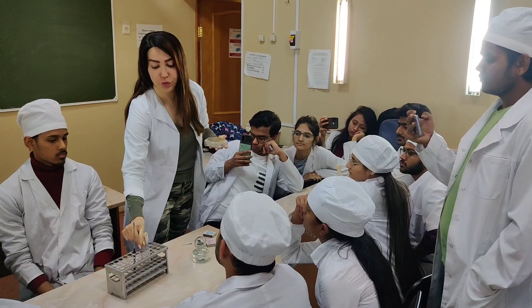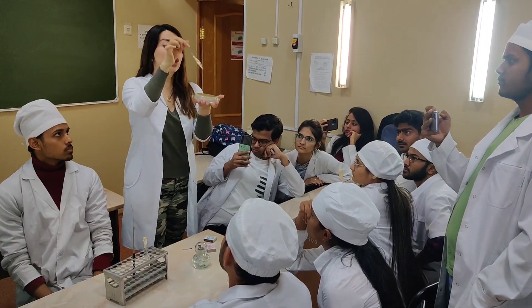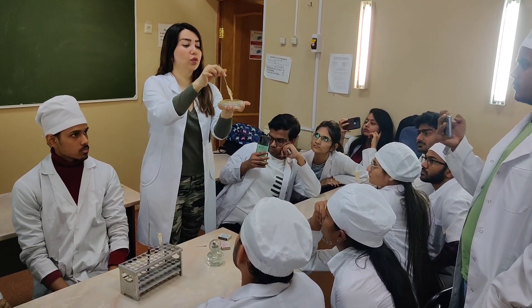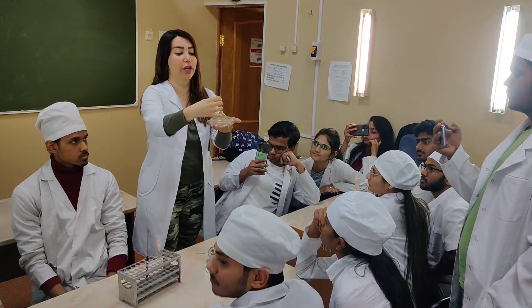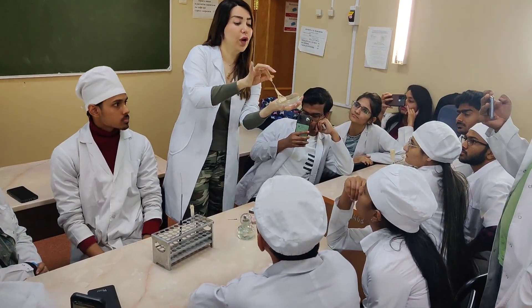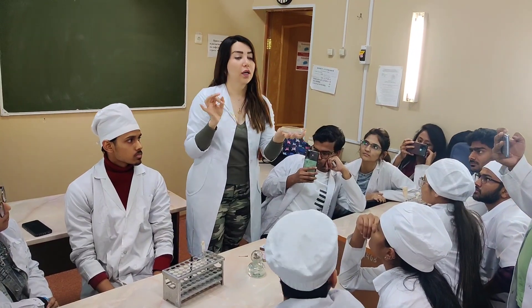After that, you will remove this one. Don't touch it because it is a streak. After that, from the center, go up, down, up, down — it is like a plus. Just change the direction: up, down, up, down. And then move from the side like this. And done.